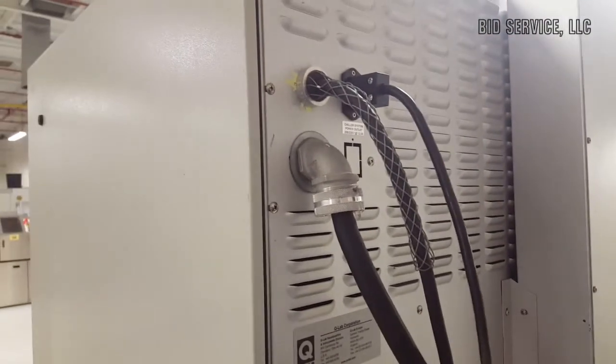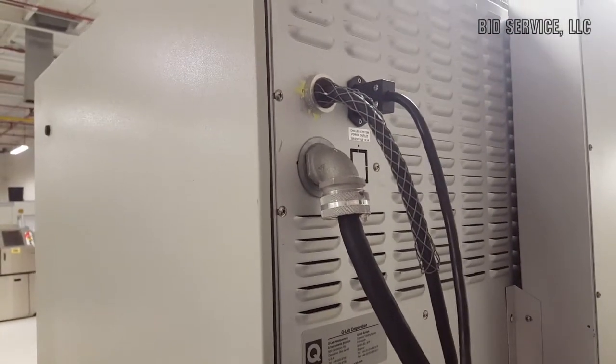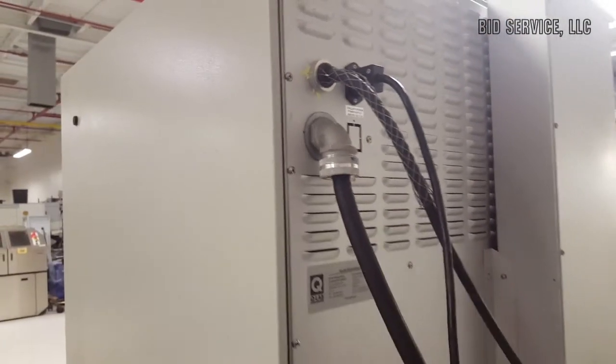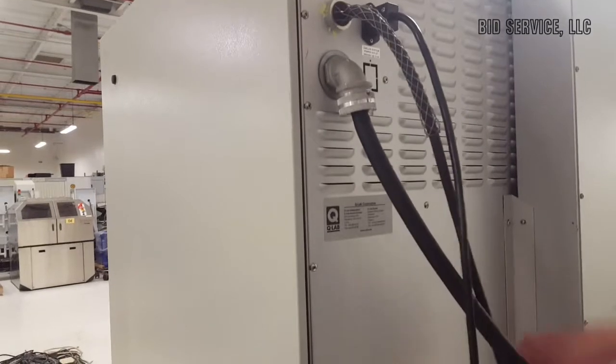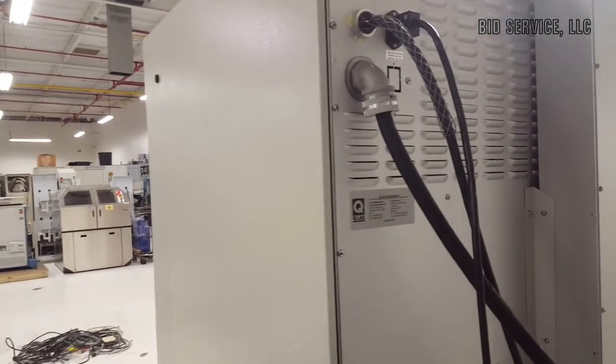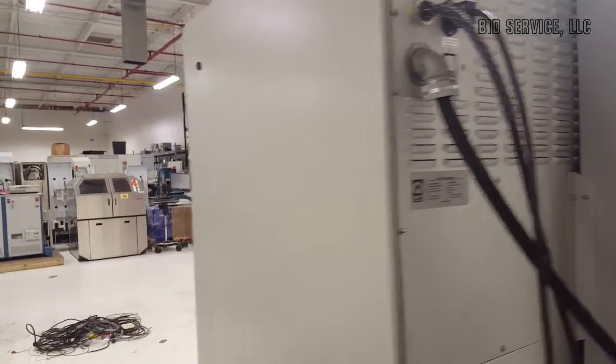This is our main power coming in. This is our auxiliary power, and this is the power going to our cooling unit.